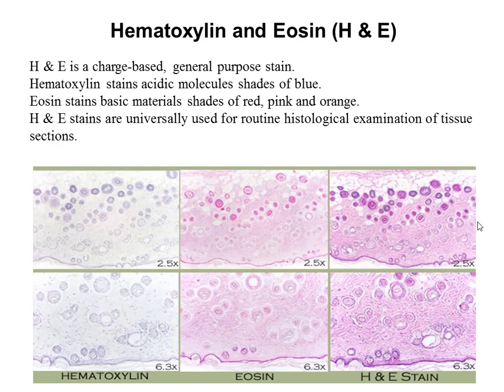Here also you can see different coloration of the substances. It's all an example of hematoxylin eosin, but sometimes, if we stain just with hematoxylin, it will be only blue. If it's eosin, it's only pink.